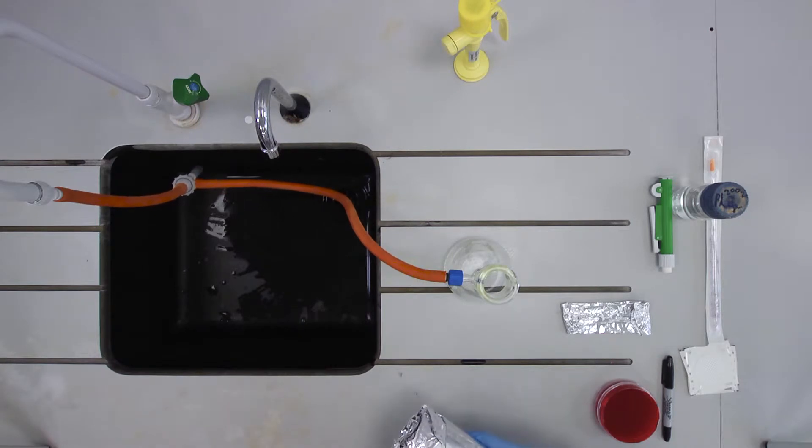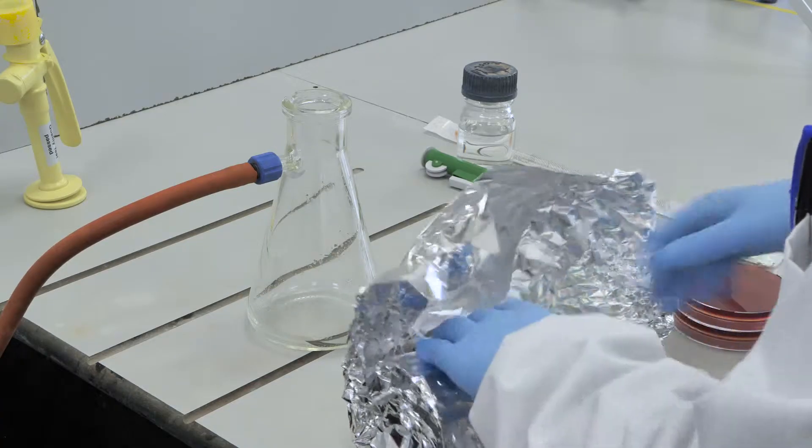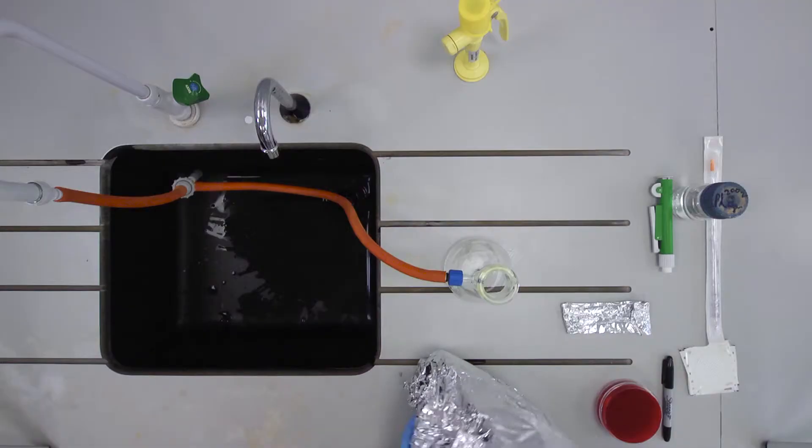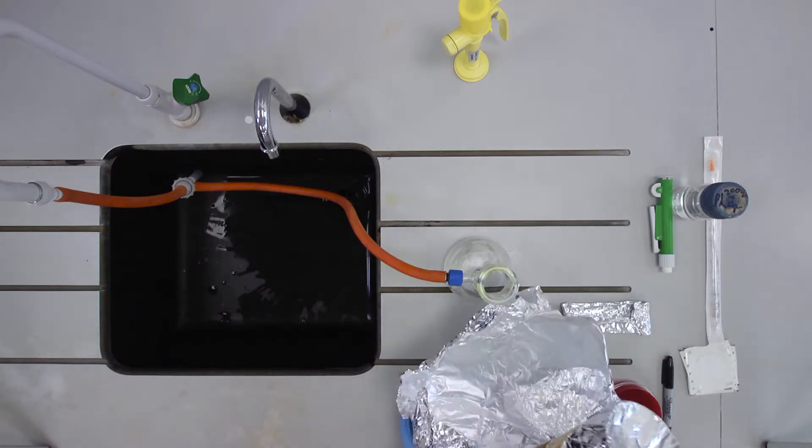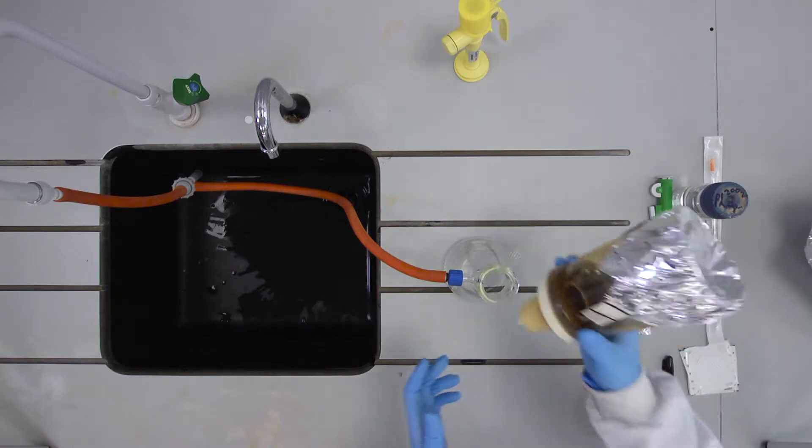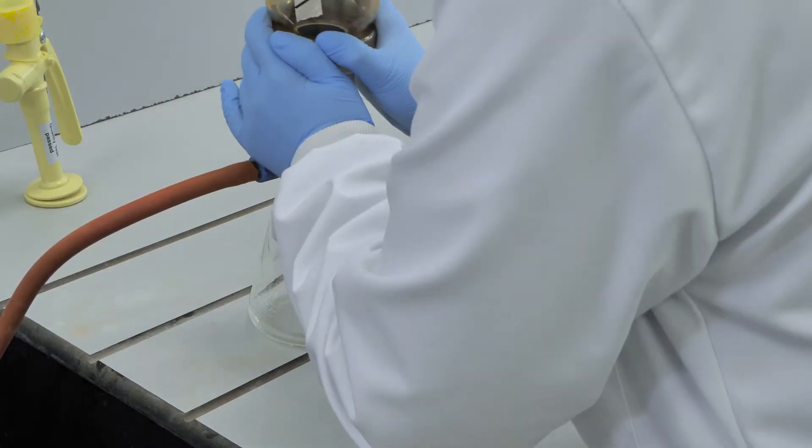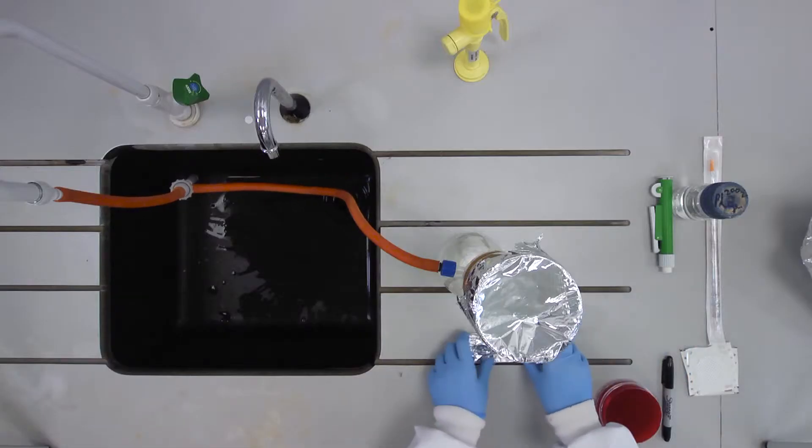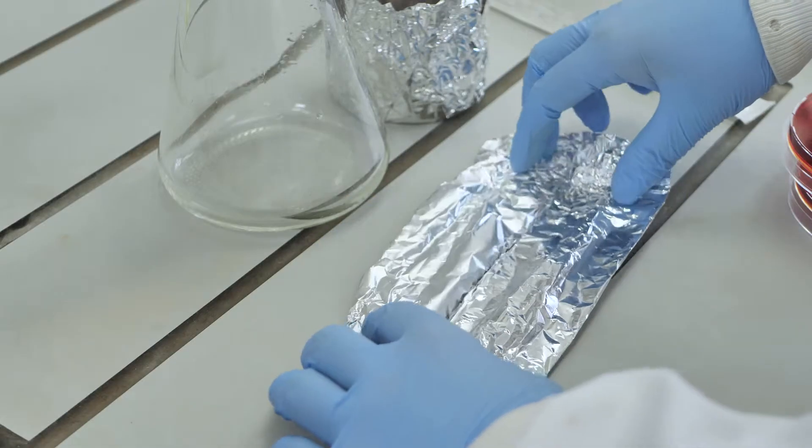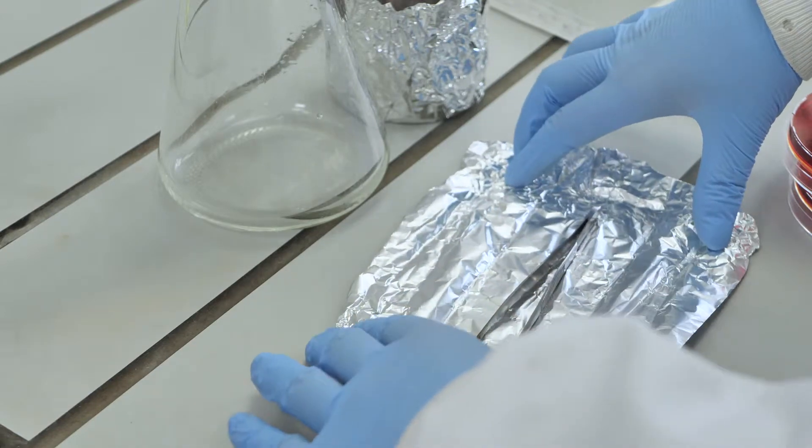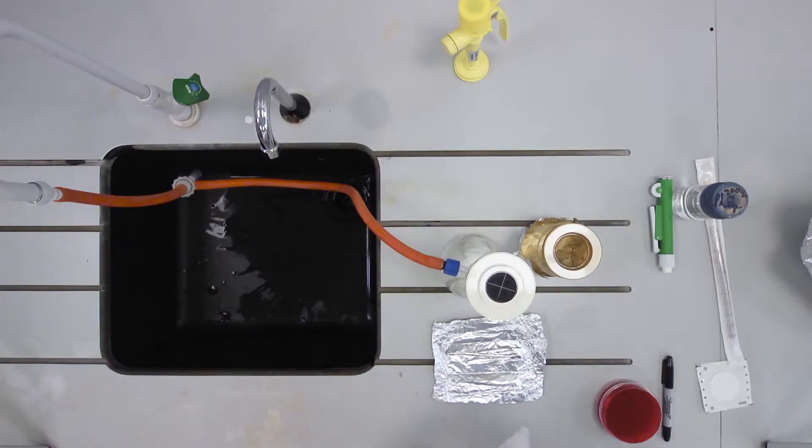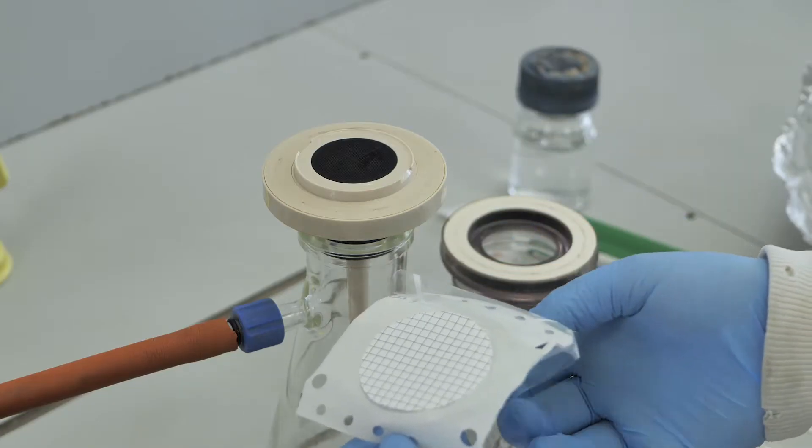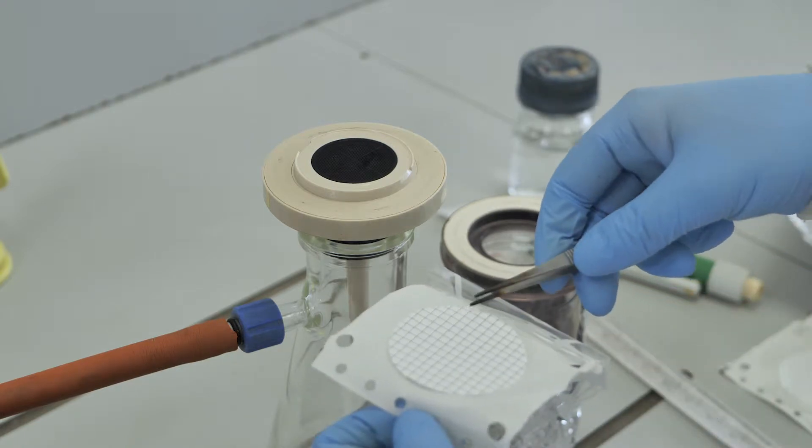Open the autoclaved filter housing unit, leaving the taped tin foil lid in place and set it securely on the vacuum flask. Open the tin foil package containing a pair of tweezers and aseptically transfer a sterile membrane filter with the grid side facing up onto the base of the filter unit.